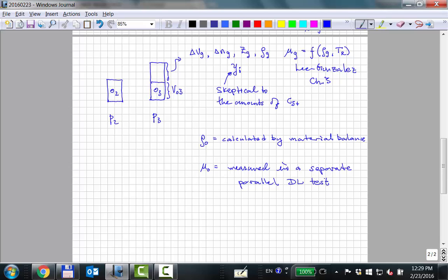So you conduct the experiment within this viscosity cell. Now, there are new types of viscometers, so they may not do it that way anymore. They may actually take some of the sample here and measure the viscosity directly. You don't need to worry too much about the exact details of how they do it. But this measurement is probably at best within about 5% accurate, and at worst it's probably in the 15% range of accuracy. For different viscometers, different methods, different laboratories, that's probably as good as you're going to get.